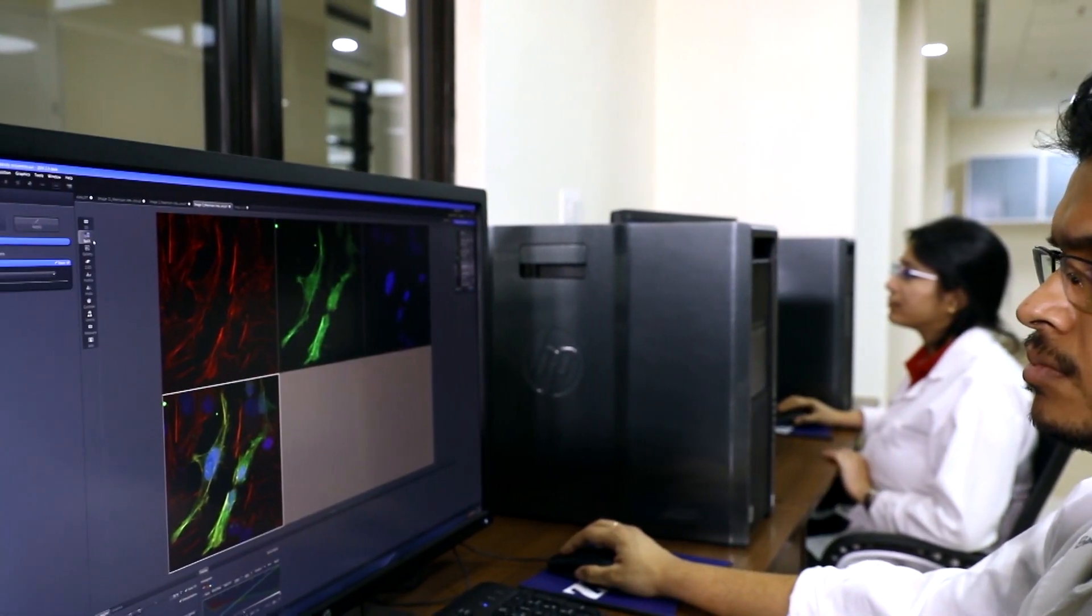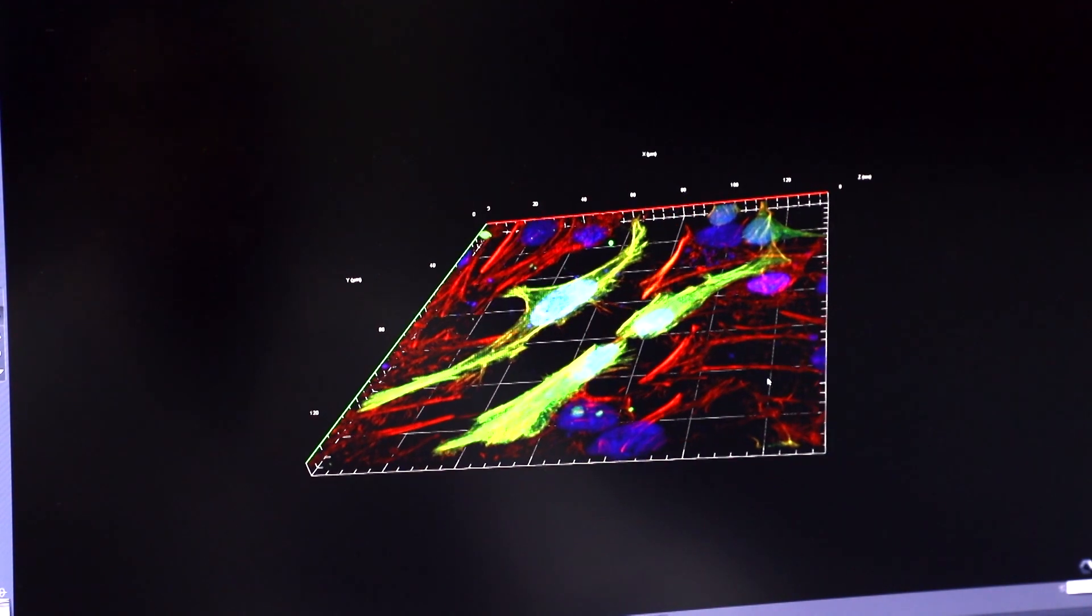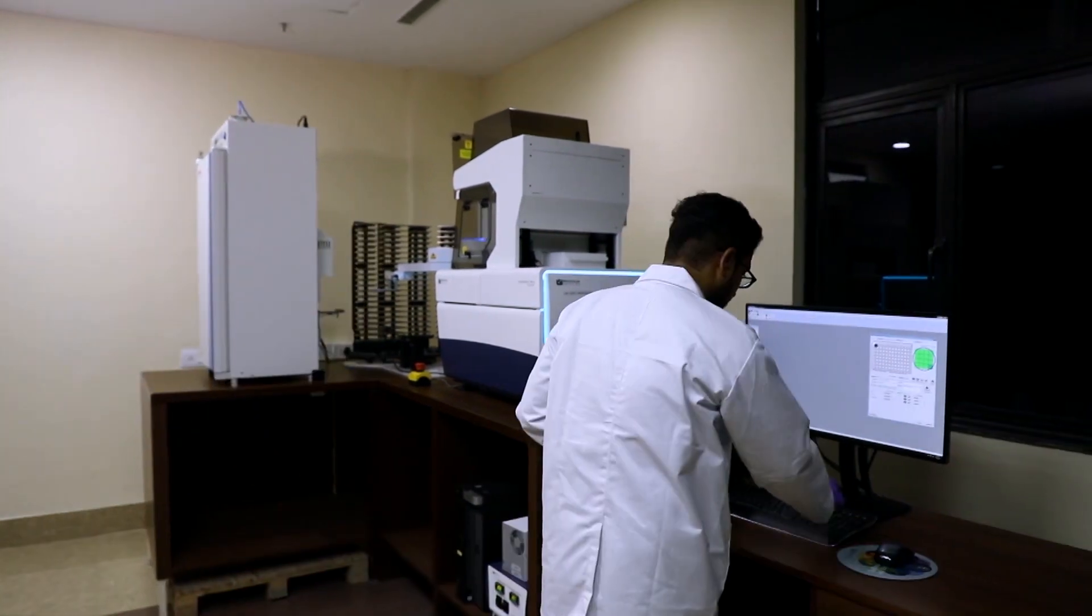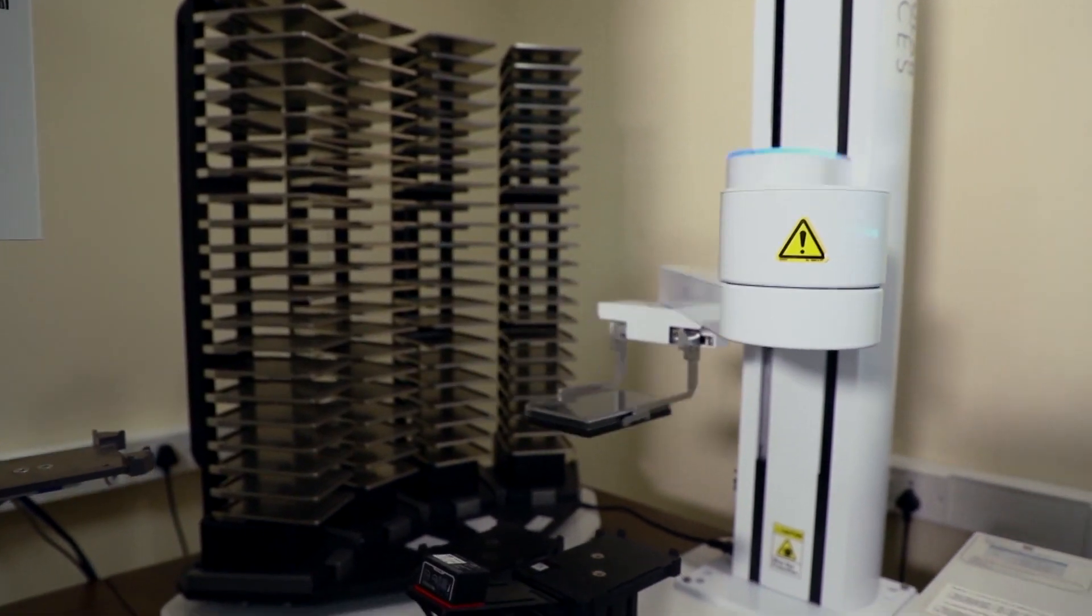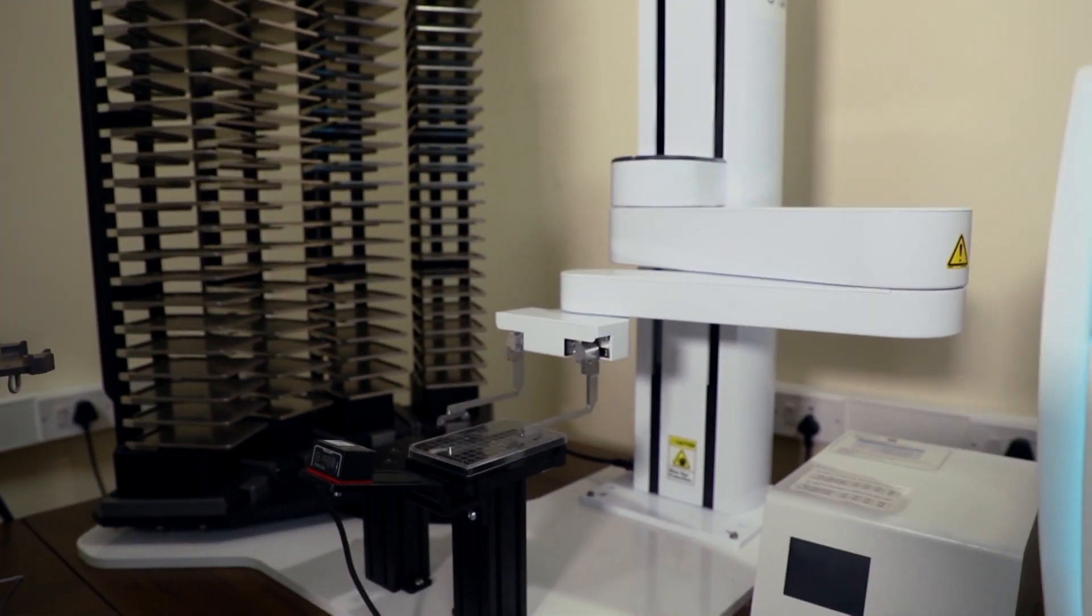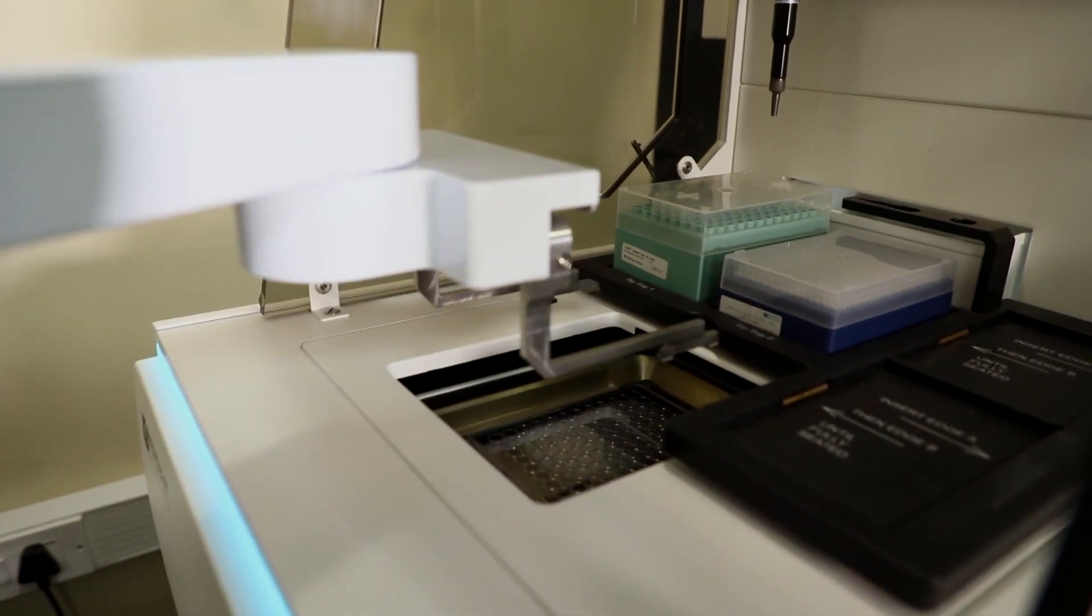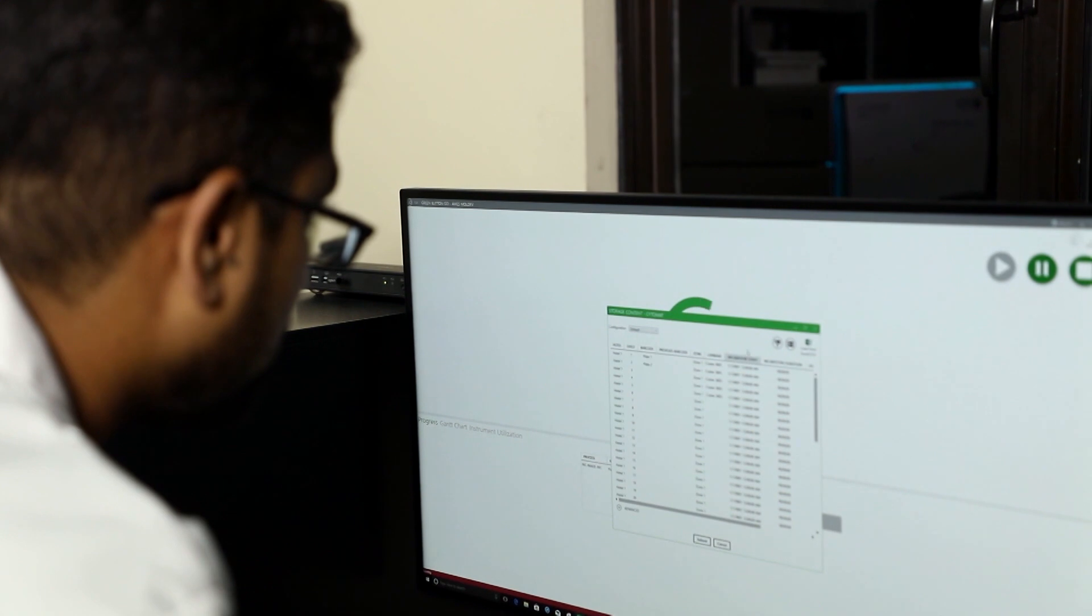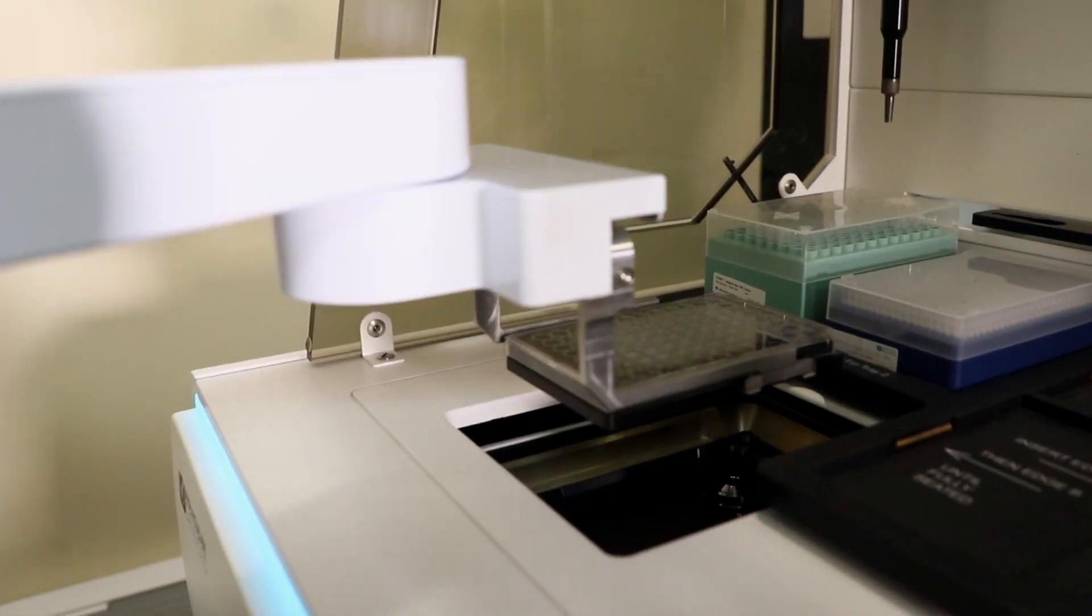Another facility of great importance at ATPC is the Optical Imaging Facility. High Content Imaging is an integrated cellular quantitative imaging and analysis system designed for rapid and automated screening of fluorescently labelled fixed and live cells in microplates and slides. The system also provides environmental control for live cell imaging, move fluids to and from cells for compound addition.